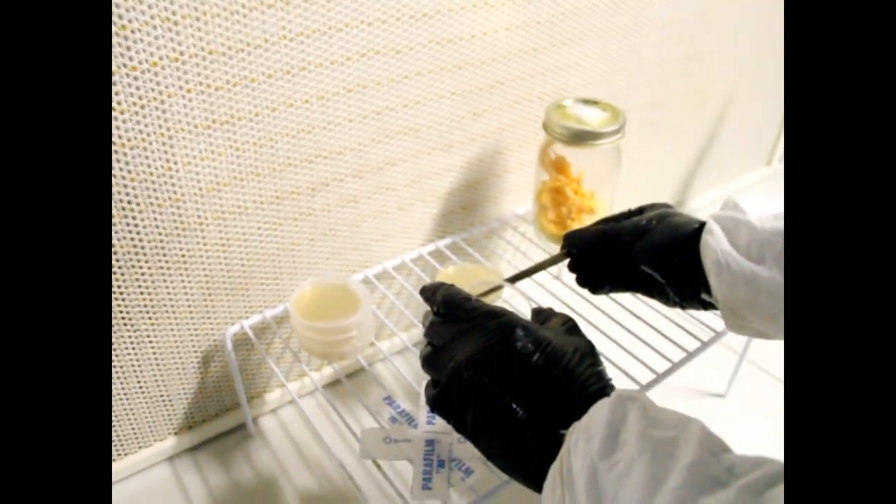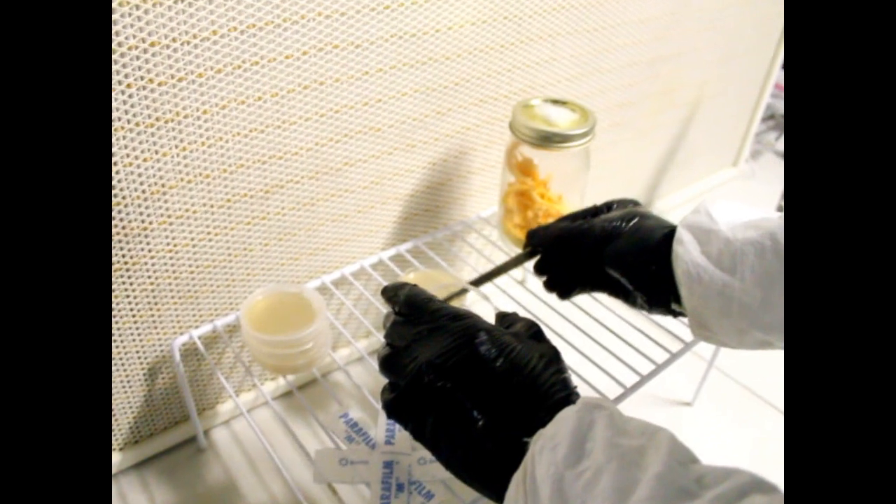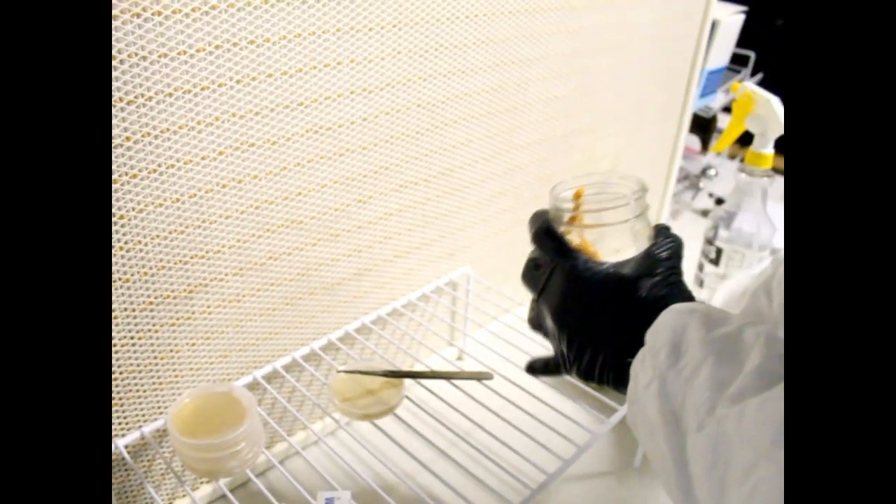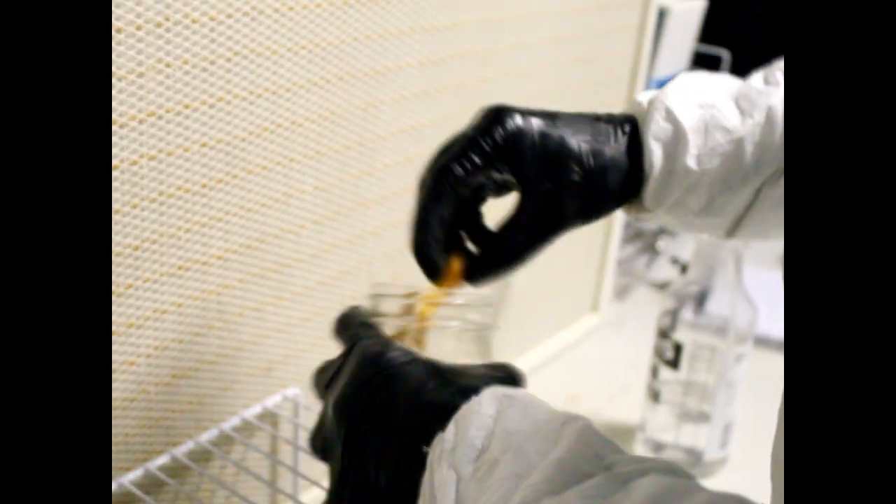We're going to cool down our tool, then grab the mushroom and scrape off these spores. I chose this mushroom because it's really fat and I want to grow more of them. We're going to grab these genetics, and these small spores are just going to land right on this nutrient dish, and then we can close the dish.